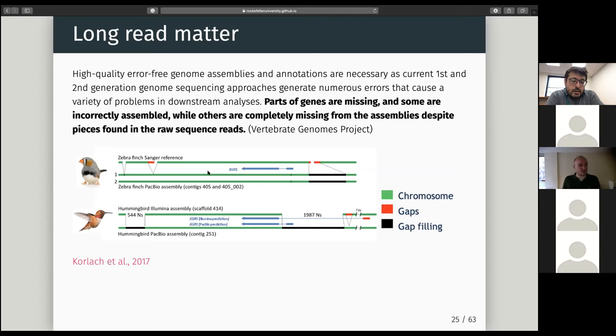Yeah, I'm sure you guys talk about it during the RNA-seq section. I always ask people to visualize the reads and see where they are in the reference genome, to see if there is anything anomalous. That's very important to look at.